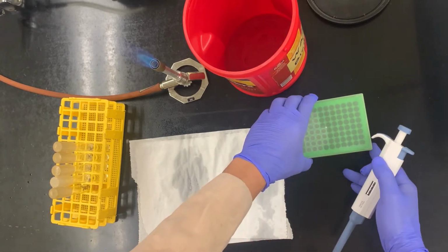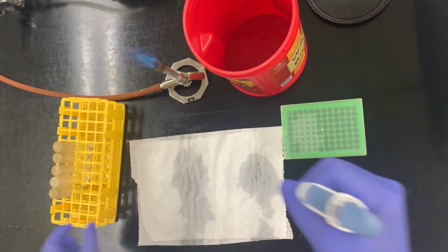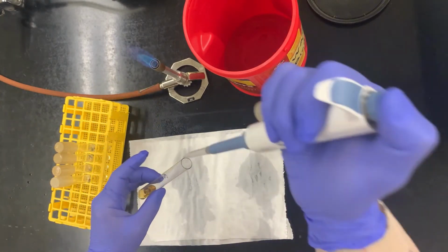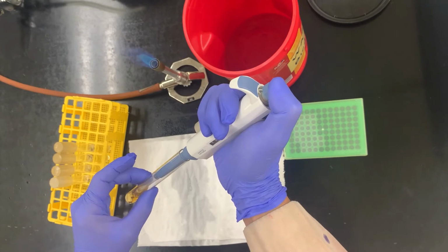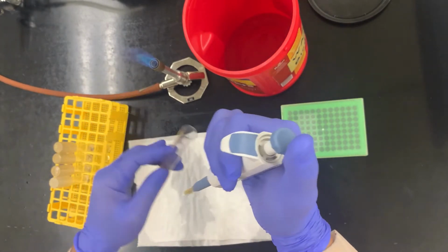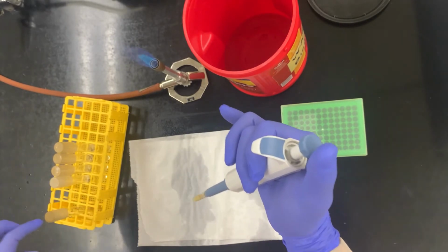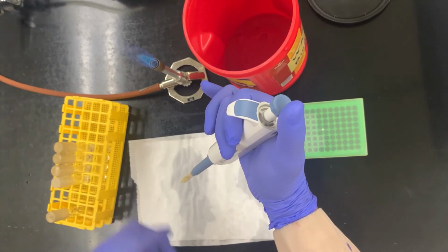So we know how to use a pipette. Keep this closed. I'm going to open, snug fit. And then remember, pinky, twist and pull, flame. And I'm going to take my 1 milliliter. First stop, nice and slow up. Make sure your tip stays in the liquid the whole time. And then that's done. Notice I'm going to leave a gap here because I'm done with this. Keep your pipette over your drip sheet at all times.